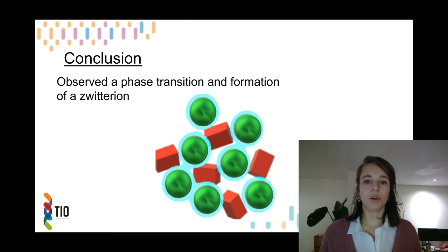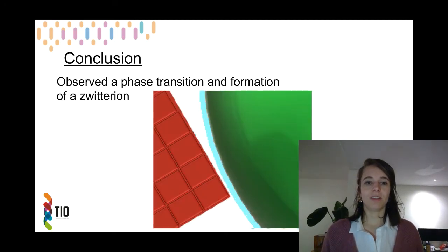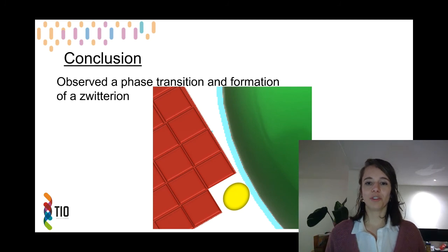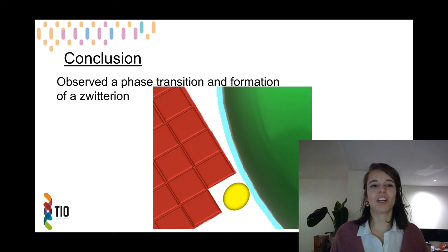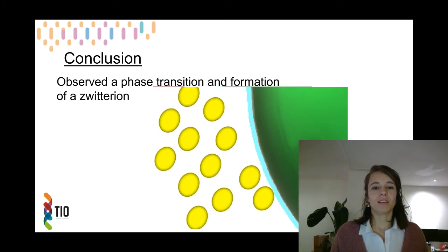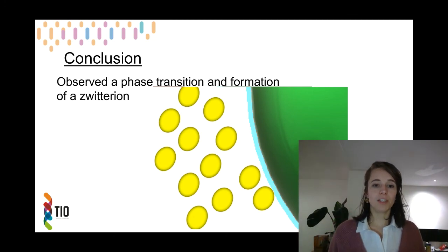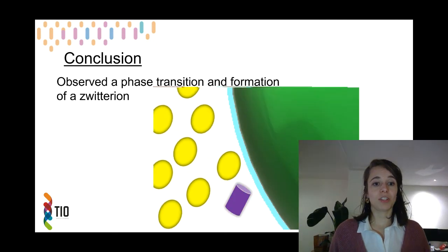And only after a closer look at the contact between the particles did we see that a little fraction of the crystalline structure gains mobility, and the structure no longer fits in the crystalline lattice, and it cuts the rigid stable bonds of the crystal, introducing a new amorphous structure. And only a small fraction is also able to dissolve, and dependent on the reigning pH of that layer between the particles, the zwitterion is formed, which can form DKP, and the equilibrium goes to the right.